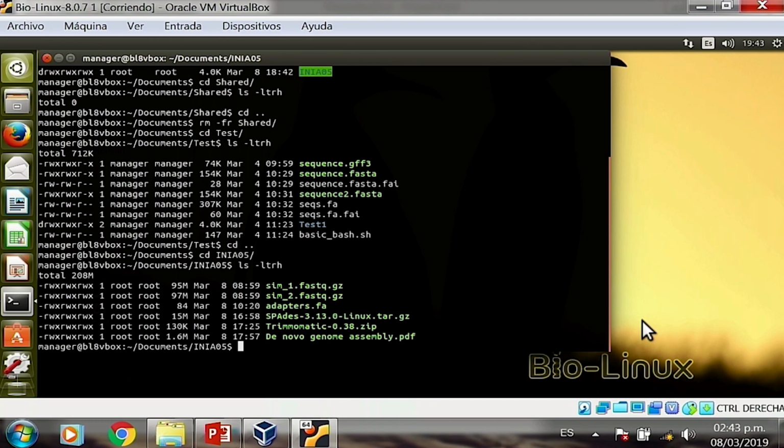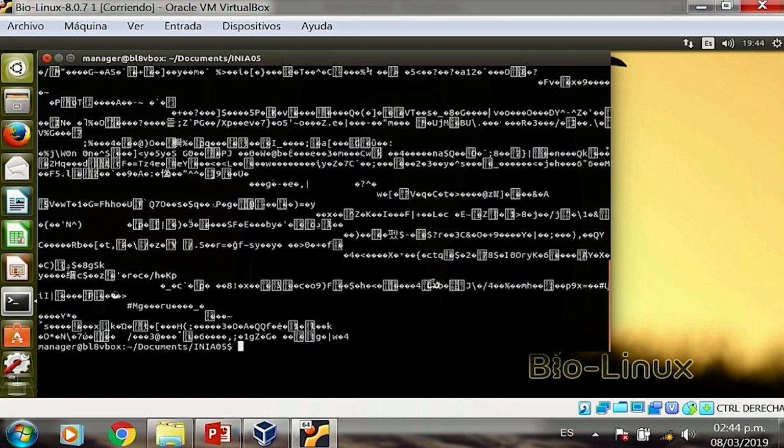Is everyone familiar with the FASTQ format? It's similar to FASTA. It has more information. Let's take a quick look. We're going to use something we learned the first class, piping. The first thing you need to understand is that from the extension alone, you have a gzip file. That means that if you try to visualize it with something like head, you cannot see it directly because it's zipped. That means it's compressed.